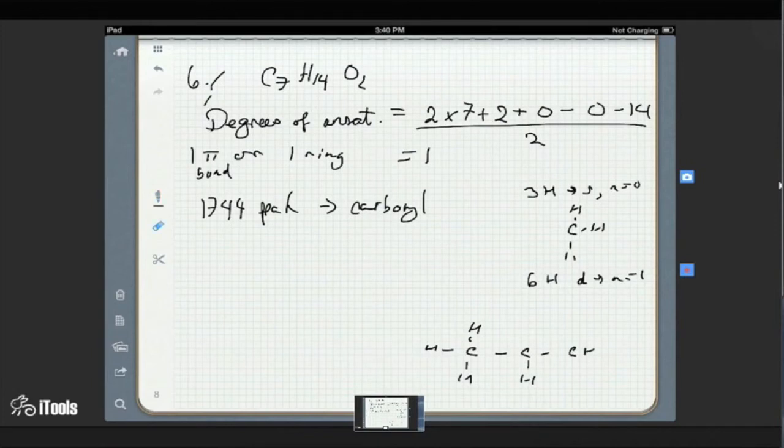How do you know there's a carbonyl? Because there's a carbonyl stretch, and then we have 1 degree of unsaturation. Okay, good. What I wanted to remind you of is that your IR table gives you detailed information about the precise IR absorption for different types of carbonyls. You'll be able to use that table during the test, so you might want to check what exactly it says about IR stretching frequencies for different types of carbonyls.